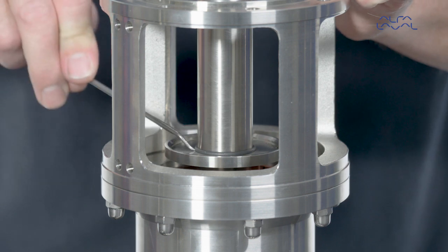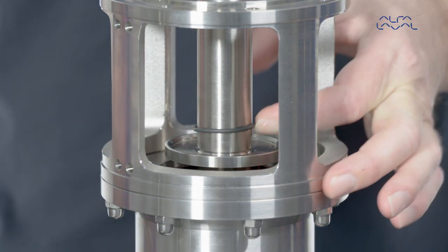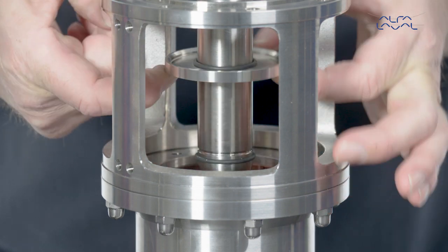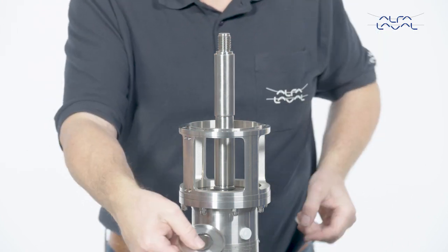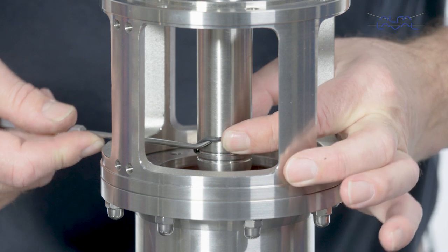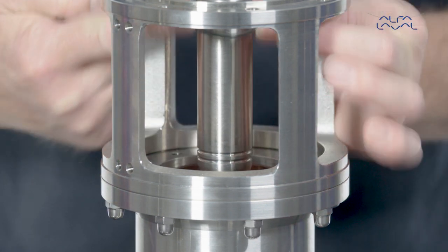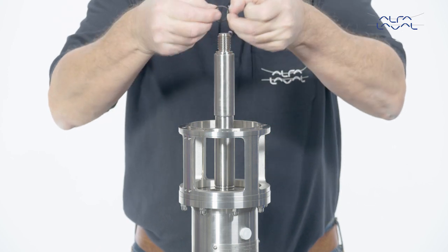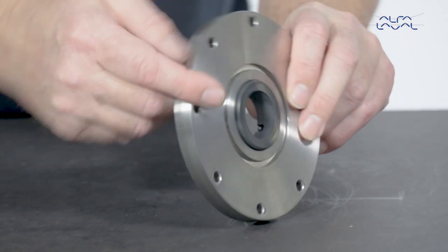Next, remove the oil trap ring and the O-rings. Push the stationary seal ring out of the mounting flange.